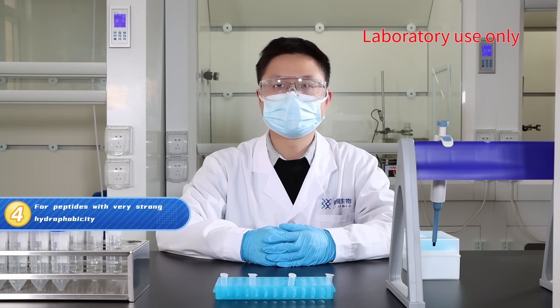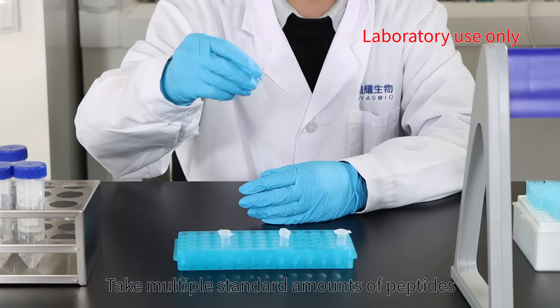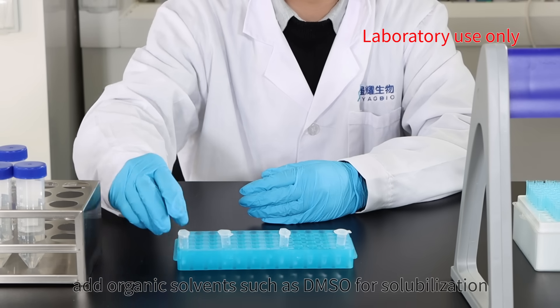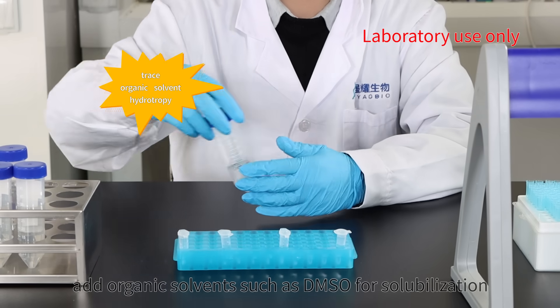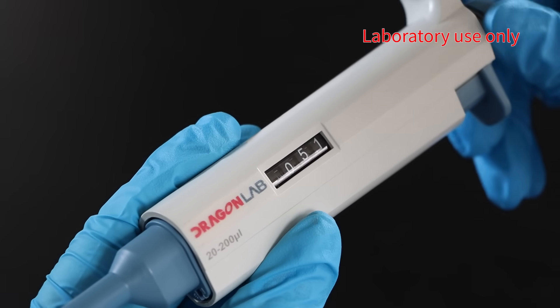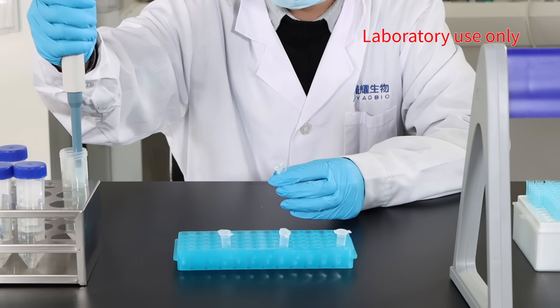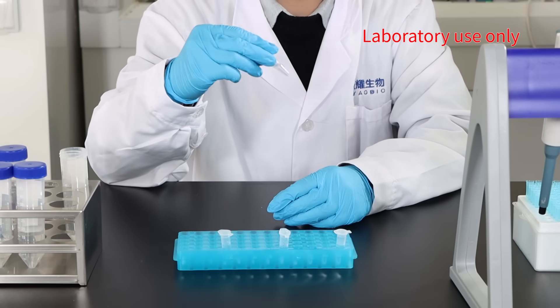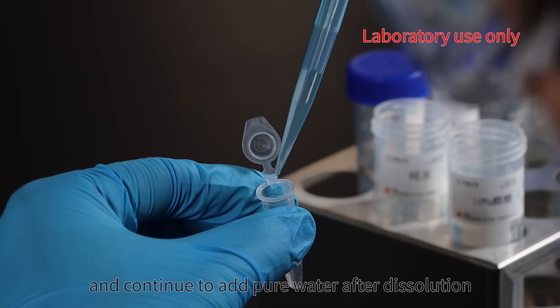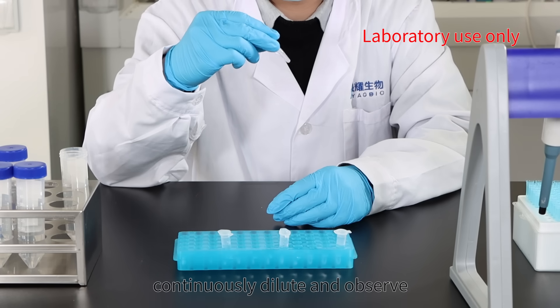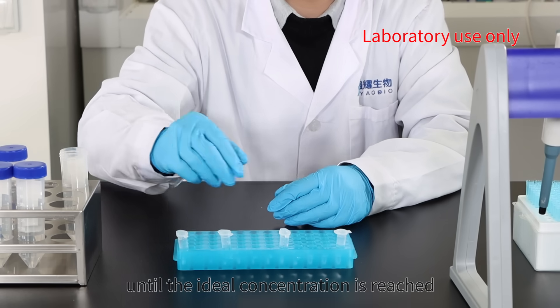Four, for peptides with very strong hydrophobicity: take multiple standard amounts of peptides, place them in a 1.5 milliliter centrifuge tube, and add organic solvents such as DMSO for solubilization. Continue to add pure water after dissolution to continuously dilute and observe until the ideal concentration is reached.